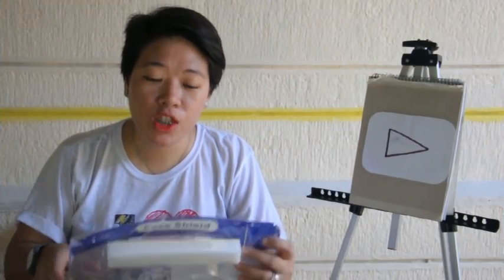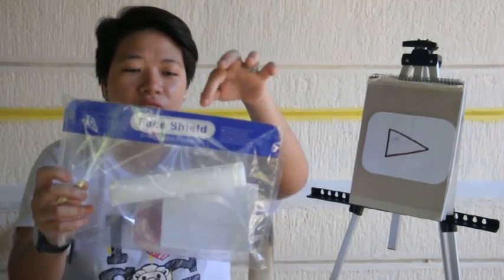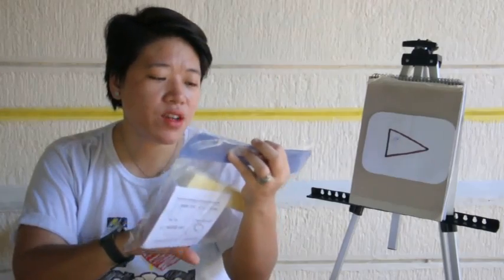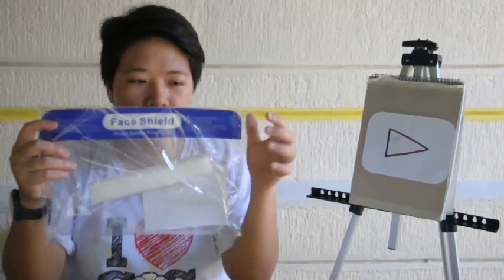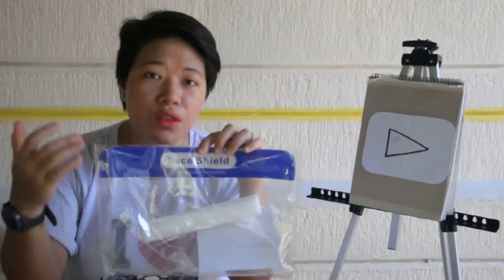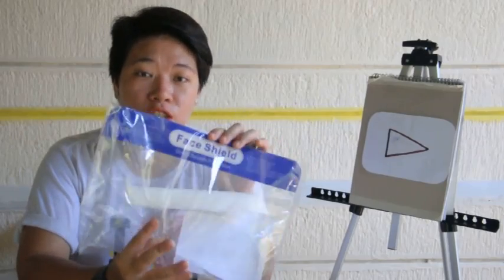Today we're going to talk about the face shield, the use of a face shield like this one. I have here this kind of face shield, and it says here direct splash protection, and there are some do's and don'ts on both sides, so you need to read through this before you assemble your own face shield.